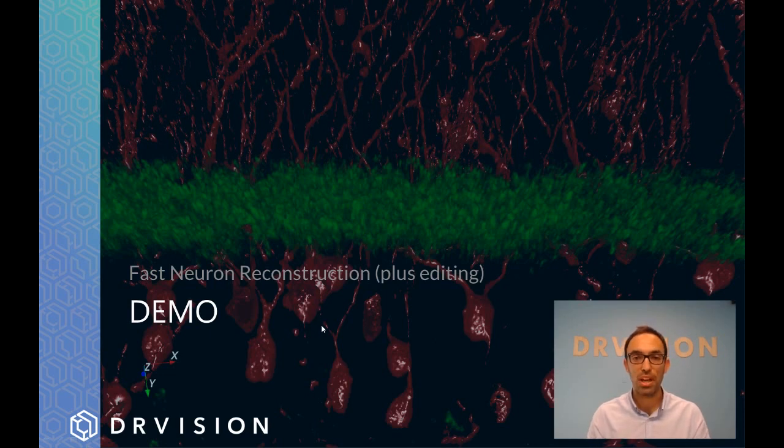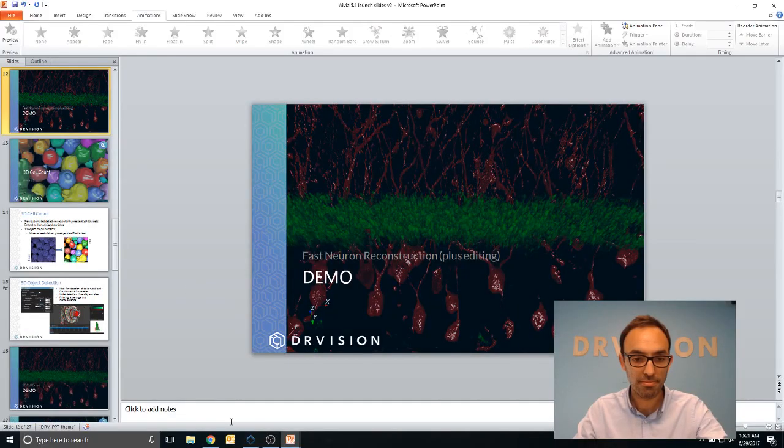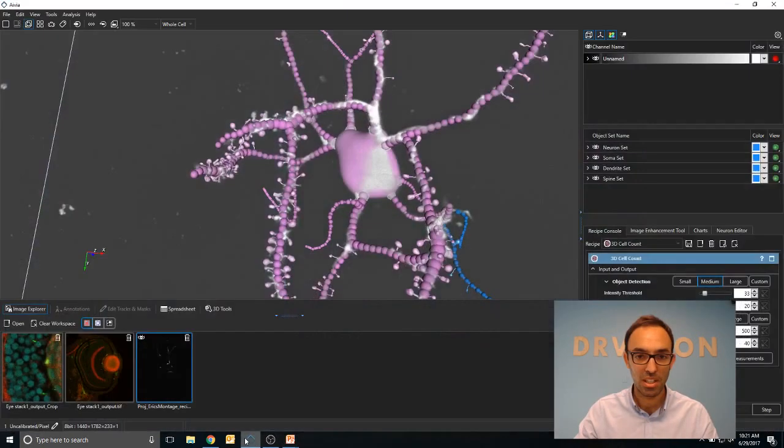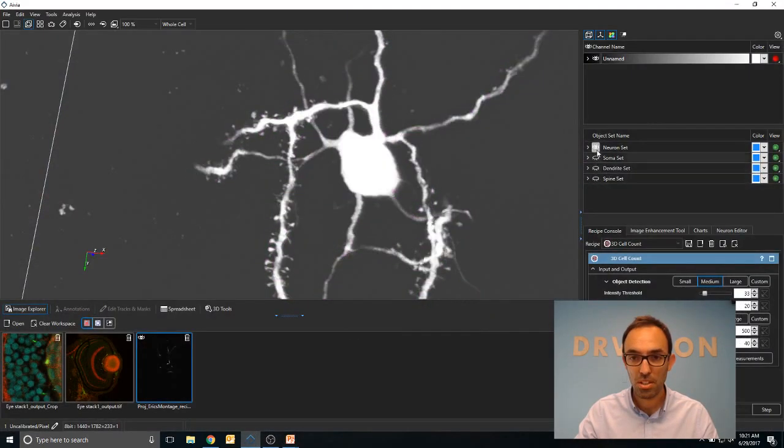Okay, so I think now I'll go into Aivia for the first time, so you get a view of how it looks. We just check if everything is going okay. Are there any questions in the meantime? Nothing to answer? No questions? Great, so I can just go here.